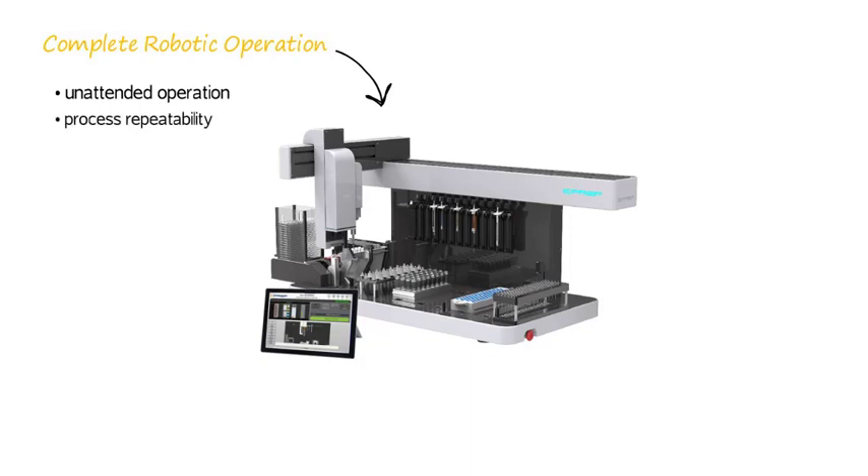Process repeatability. The great feature of a robot is it will do what you tell it to do, and always do it the same way. Methods are easily transferable to other ePREPs, either in the same lab or somewhere else.